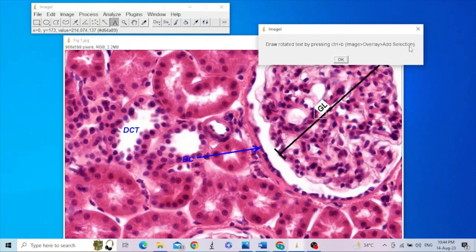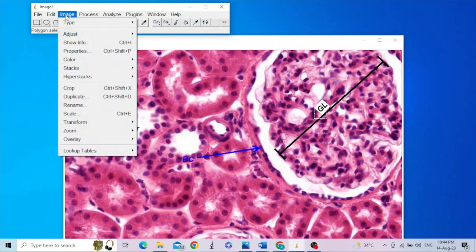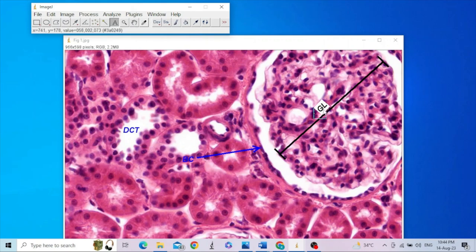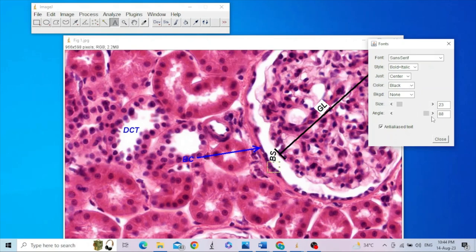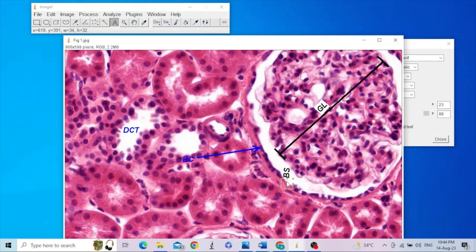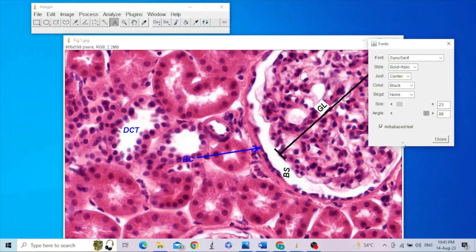For angled text, instead of using Edit > Draw, go to Image > Overlay > Add Selection. This properly renders the angled text onto the image. For example, if you want to add a label at 90 degrees for Bowman's space, double-click the text, set the angle to 90 degrees, then go to Image > Overlay > Add Selection. This is how you annotate your image in ImageJ — adding text, arrows, barred lines, and text at various angles like 90 or 45 degrees.